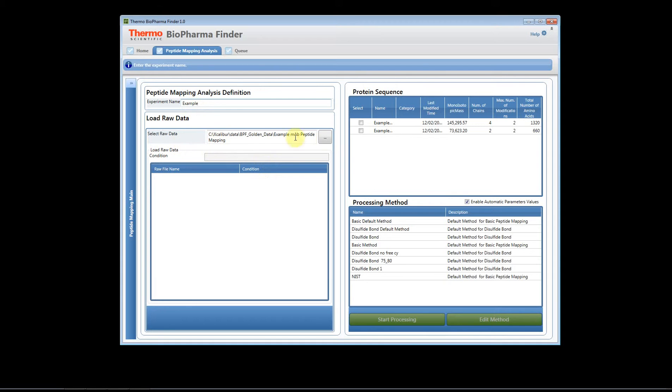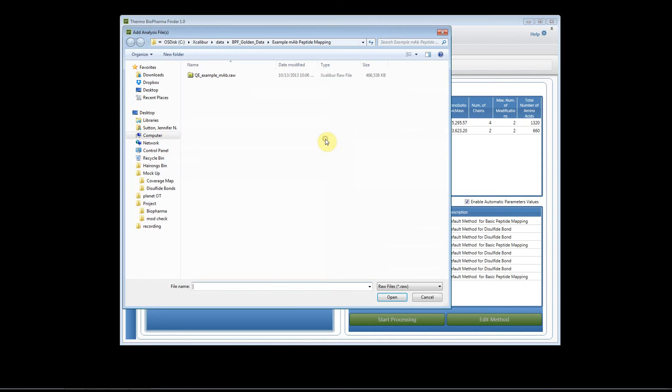We're going to browse for our raw file and here's our file. We're going to click open.